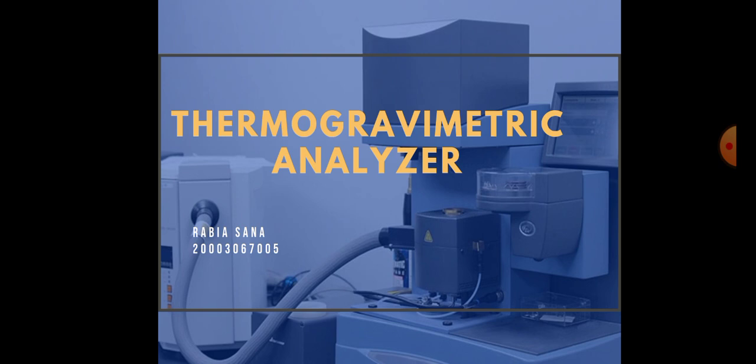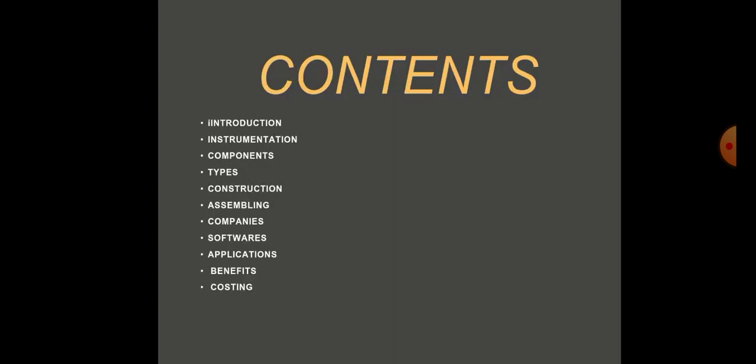Today our presentation topic is thermogravimetric analyzer. In this presentation we will see introduction, instrumentation, components, types, construction, assembling, companies, softwares, applications, benefits, costing.